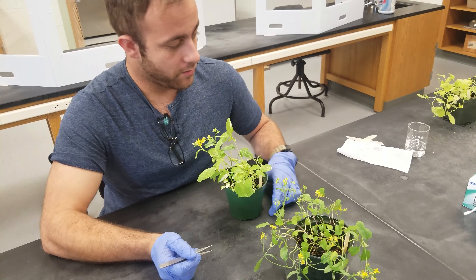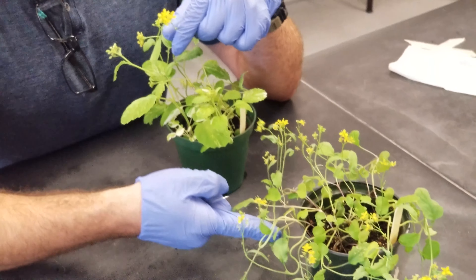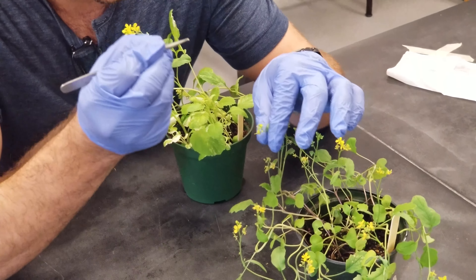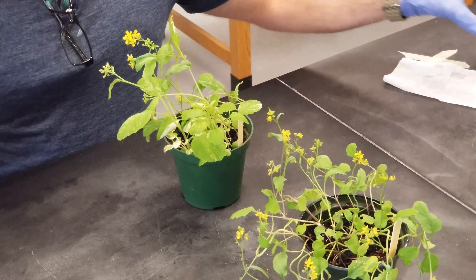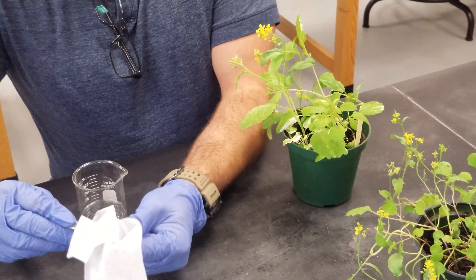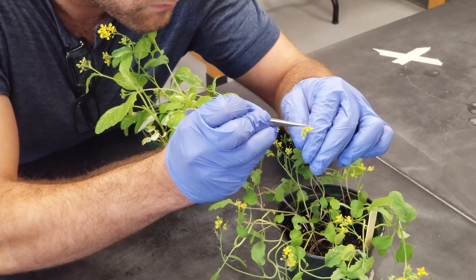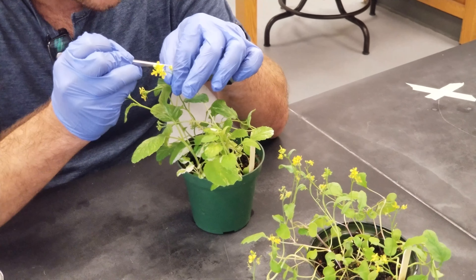Following the same procedure as the last cross, I'm going to cross variegated with wild type. First, I'll remove the anther with the pollen from the variegated and pollinate the pistil on the wild type. Then I'll clean off my forceps and set up the reciprocal cross, removing the anther from the wild type and cross-pollinating the pistil on the variegated.